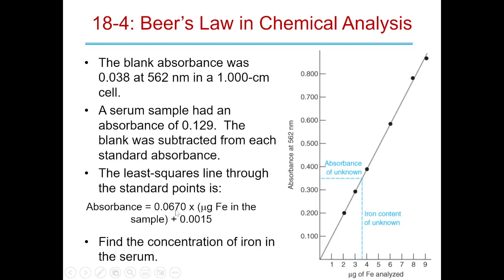It looks a bit like Beer's law, but it will never be exactly like Beer's law because it always has a y-intercept. And the y-intercept should never actually be 0, it should be something close to 0, because this is real data. You're never actually going to be on 0. There's always going to be some light that's scattered and you couldn't get, okay? If it is 0, you know something went wrong.